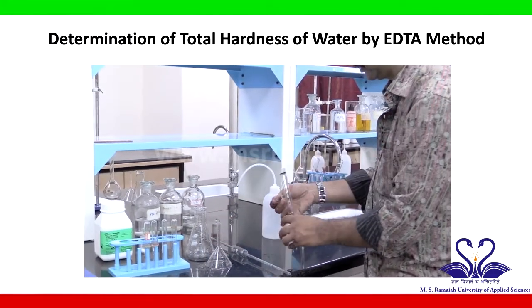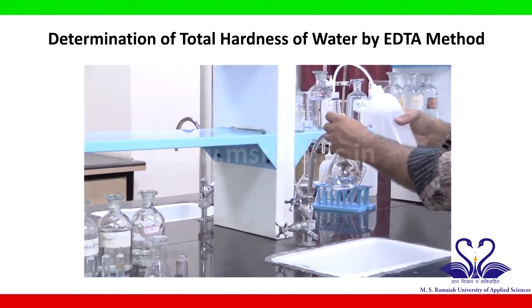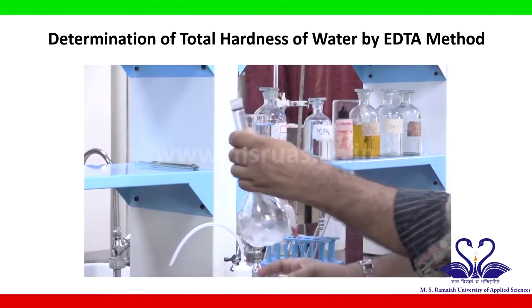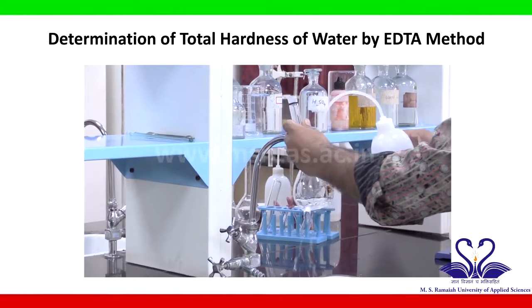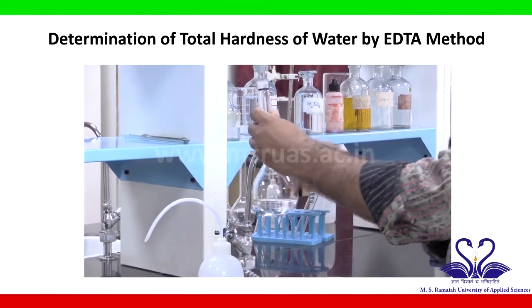And then the standard flask, where you are preparing your standard EDTA solution. The cap also.